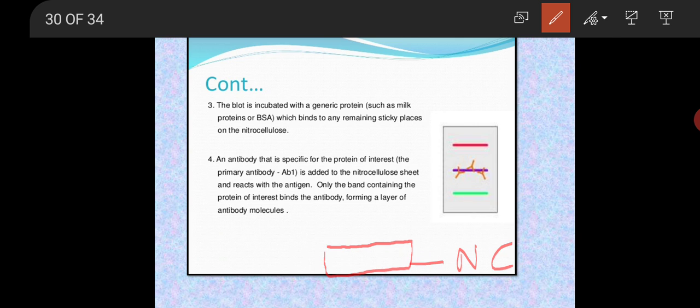Okay, onto that membrane there is your gel which contains the separated fragments. ठीक है, तो यहाँ पर है निगेटिव चार्ज इलेक्ट्रोड. Onto the top there is negative charge electrode, at the bottom there is positive charge electrode. Movement will be from negative to positive. Okay, movement कैसी होगी? From negative to positive of that molecules जो जेल में है.